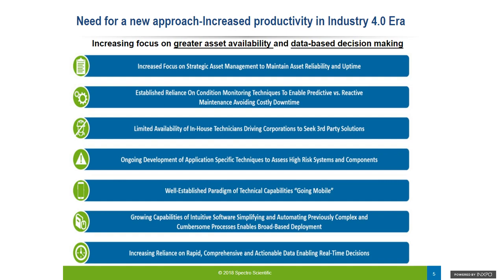There's already a very broad demand for intuitive software that will simplify and automate previously cumbersome, complex processes so that you can get rapid and actionable data for real-time decisions. Oil analysis for industrial plants has been an established condition monitoring technique for over 50 years. Let's look at it now.